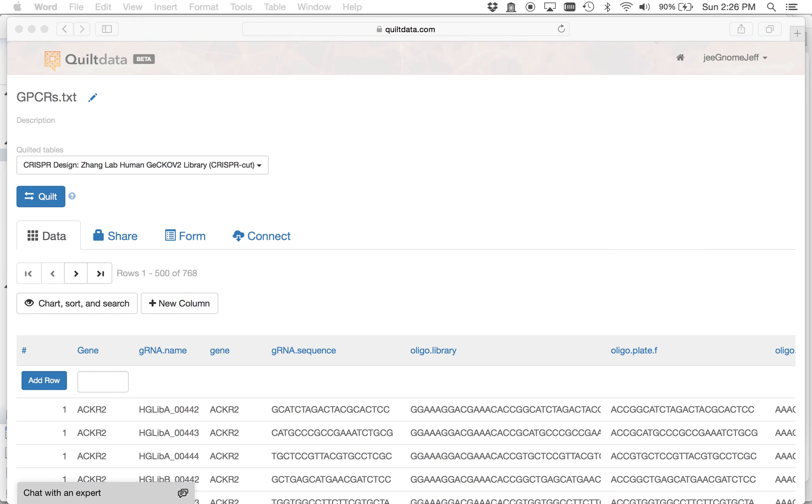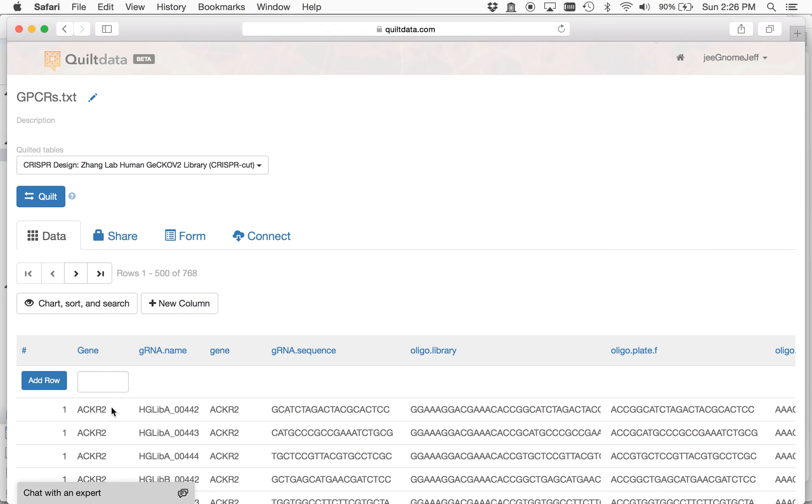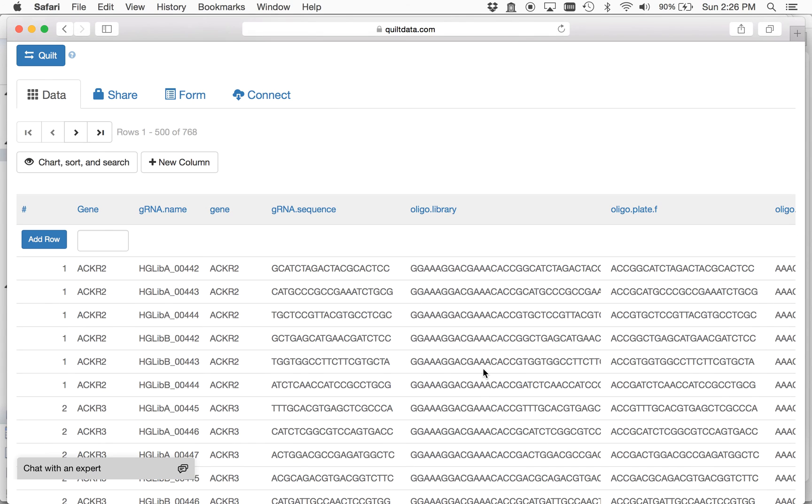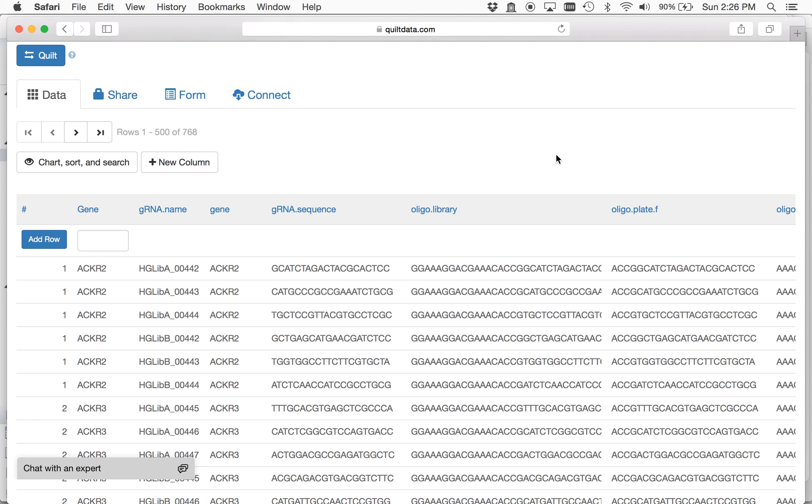And that's what you're seeing here in this file, here on Quilt, is for each of these genes you have the oligos here that you can use to start cloning your library. So now that you've generated this file, you can share this with others or you can export it for your future use.